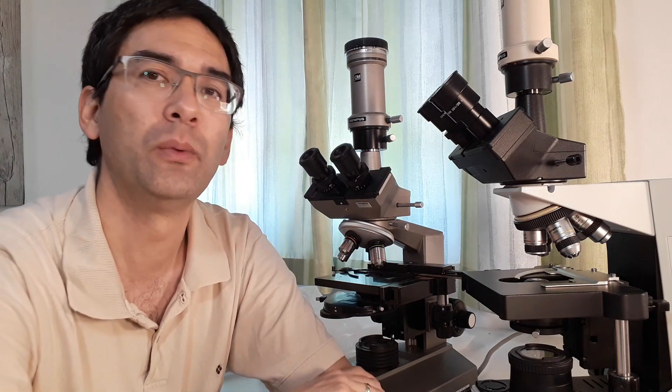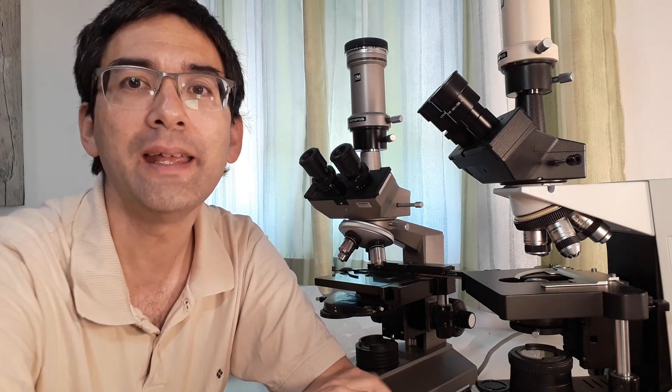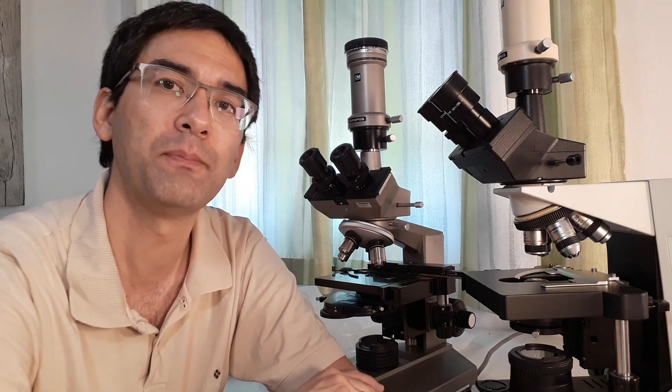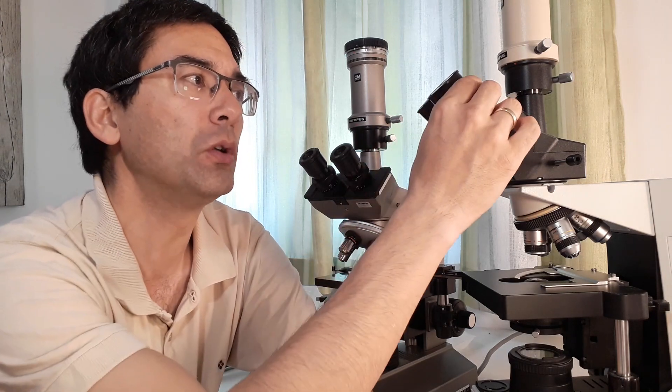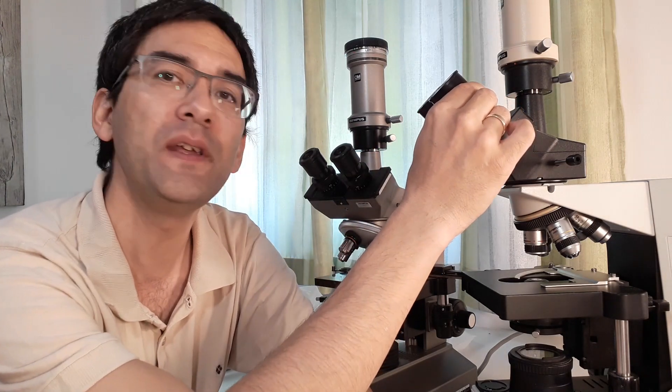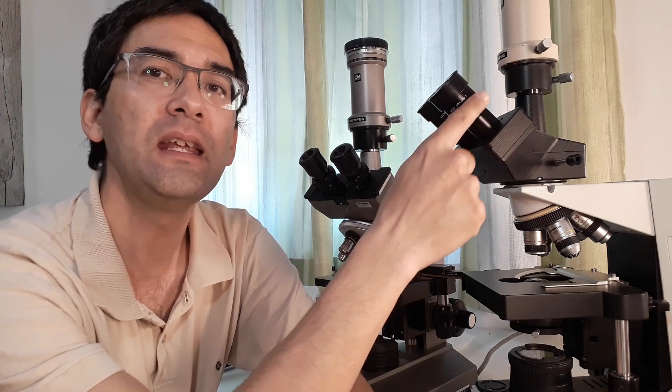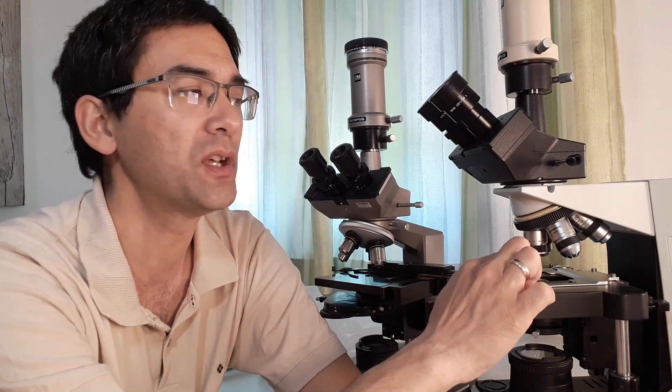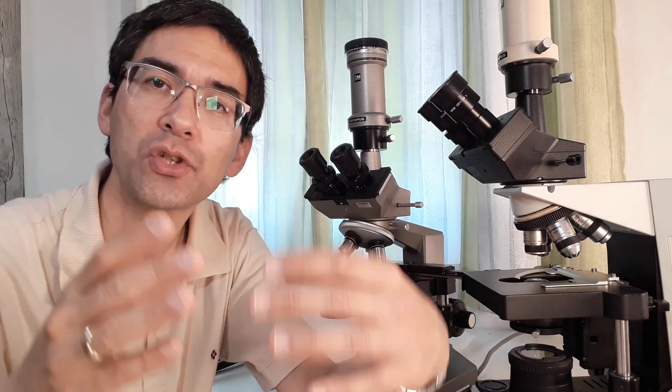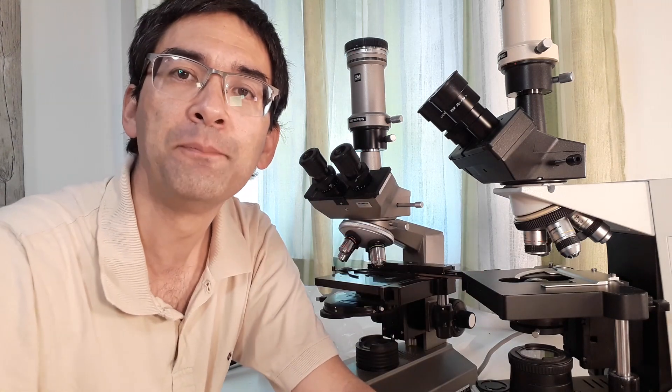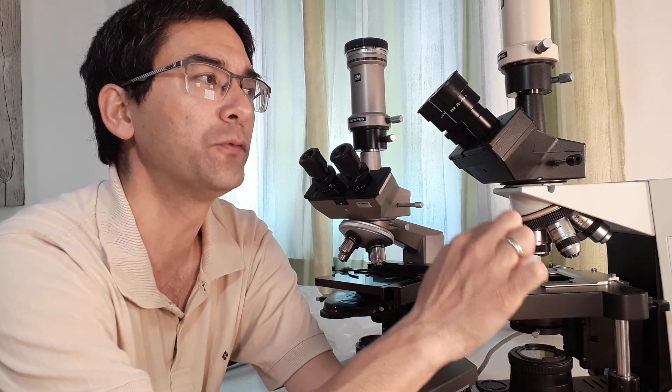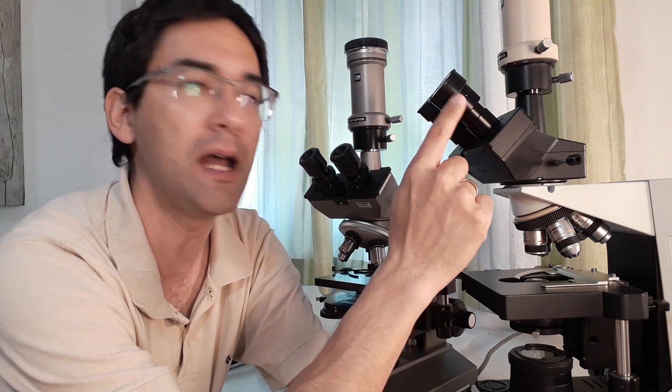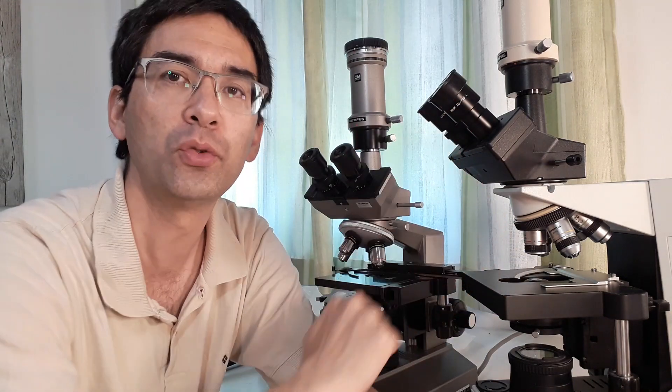However, there's also a second reason. The high-end microscope manufacturers produce so-called compensating eyepieces that correct lens errors, for example chromatic aberration, which the objective produces. Chromatic aberration gives you color fringes around the objects, but these color fringes are removed, or at least partially removed, by the eyepiece.